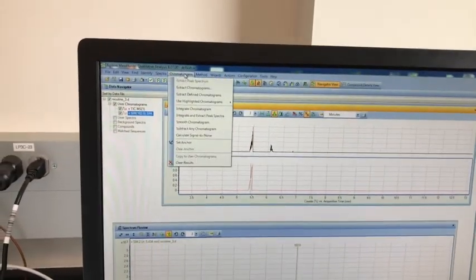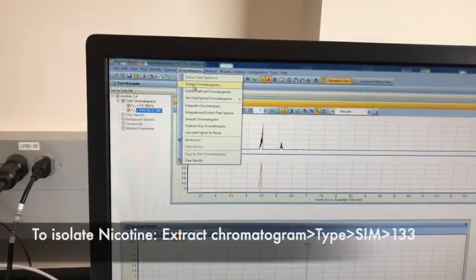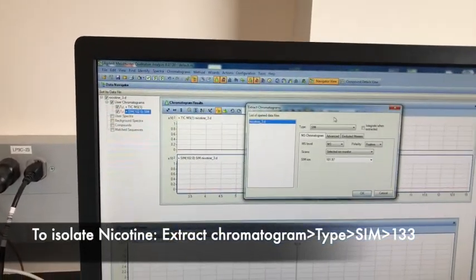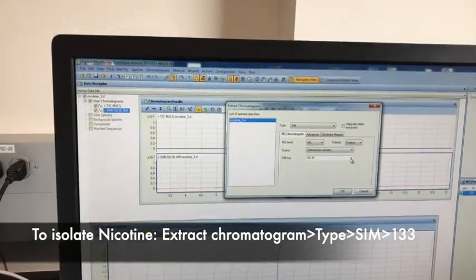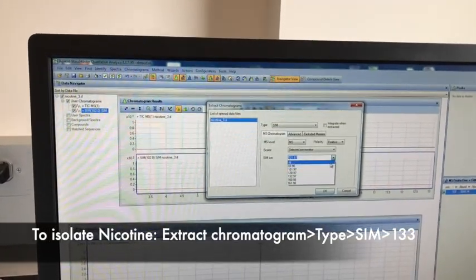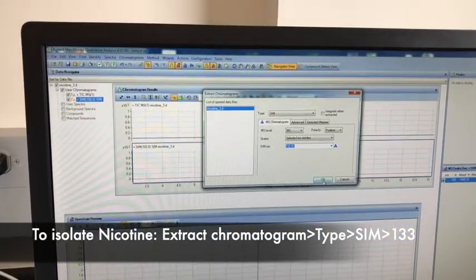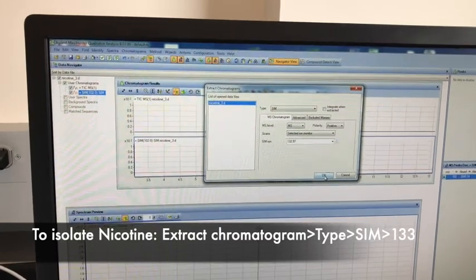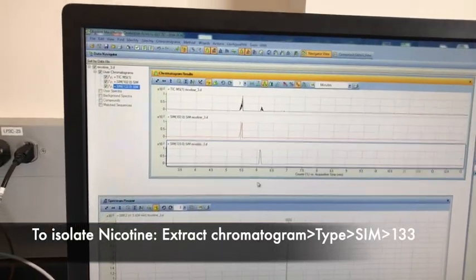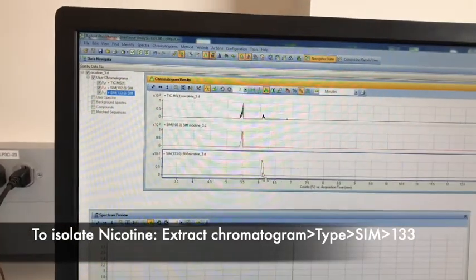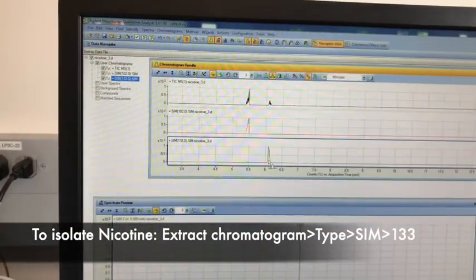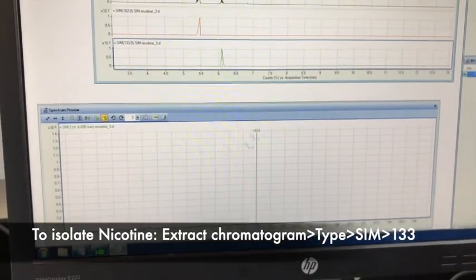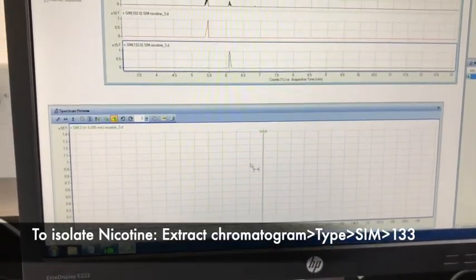Similarly, we're going to go back to Chromatograms, Extract Chromatograms, Selective Ion Monitoring, and choose m/z 133, or the value closest to 133. Click OK. You'll notice we've got nicotine now. If I double click on that, I get only the nicotine peak.